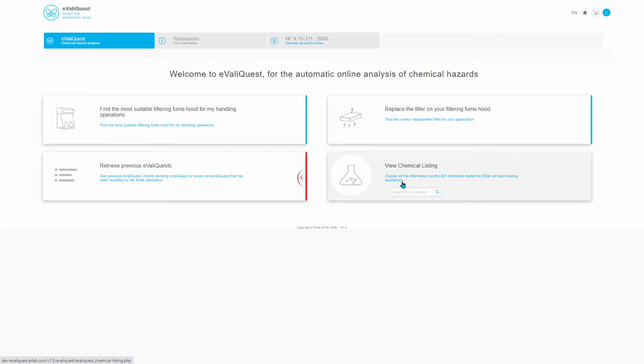In this video, I'm going to show you how you can replace a filter on your existing ductless fume hood. To do so, we are here on the home page and you click on Replace the filter on your filtering fume hood.